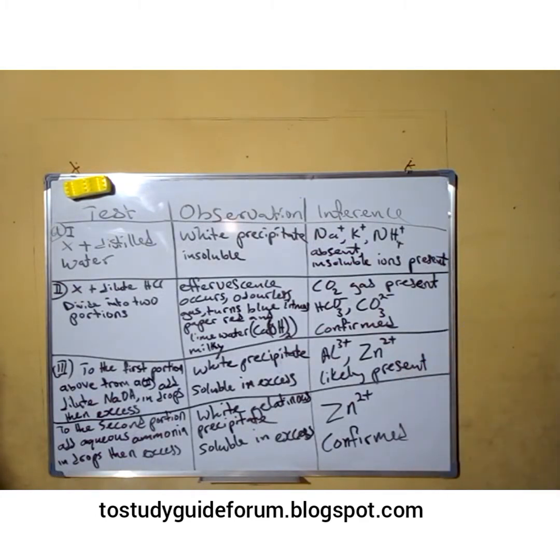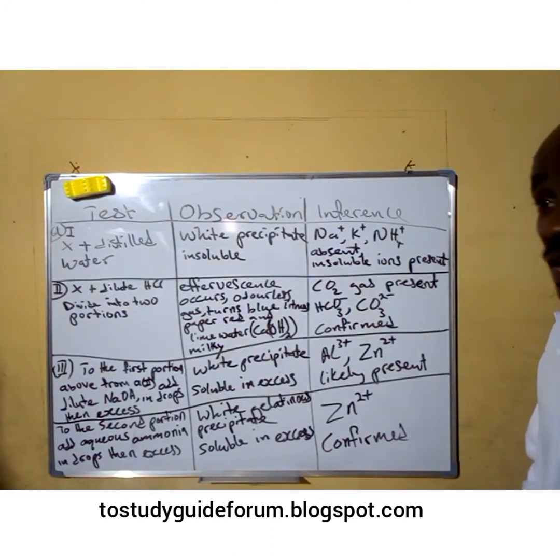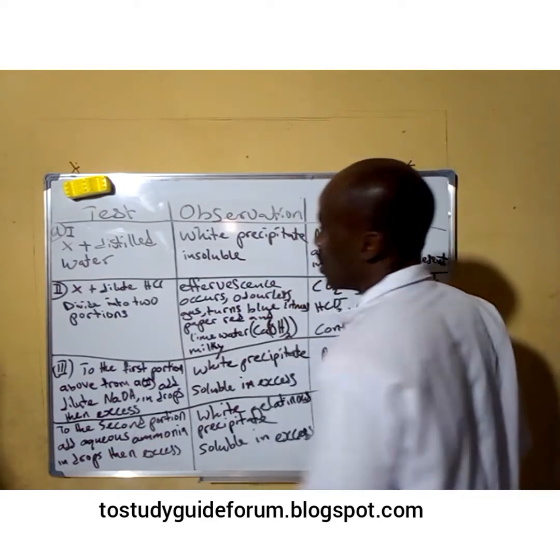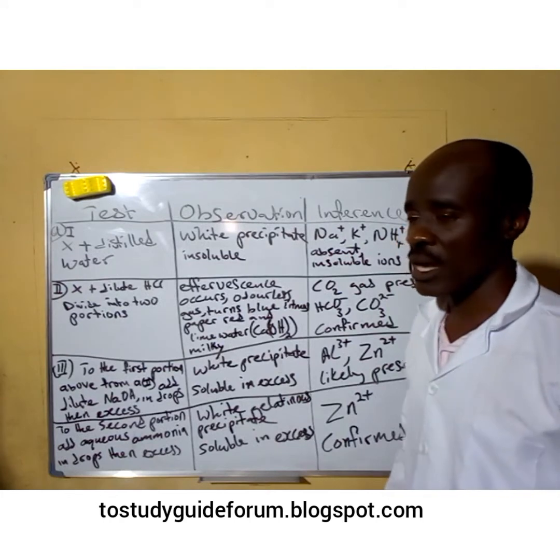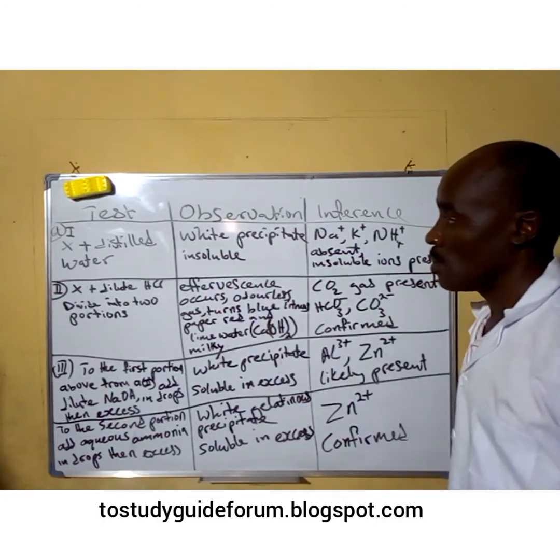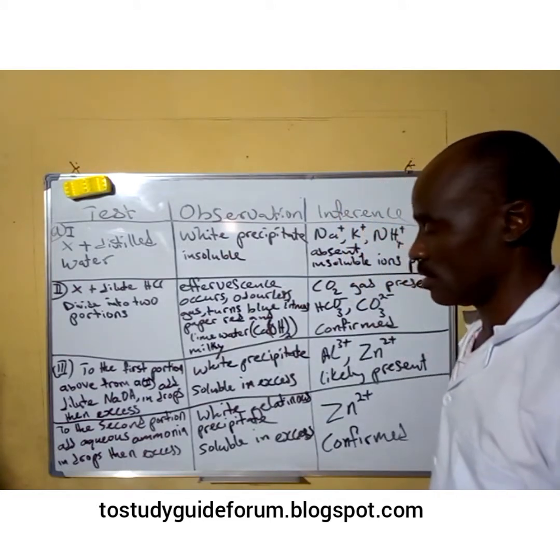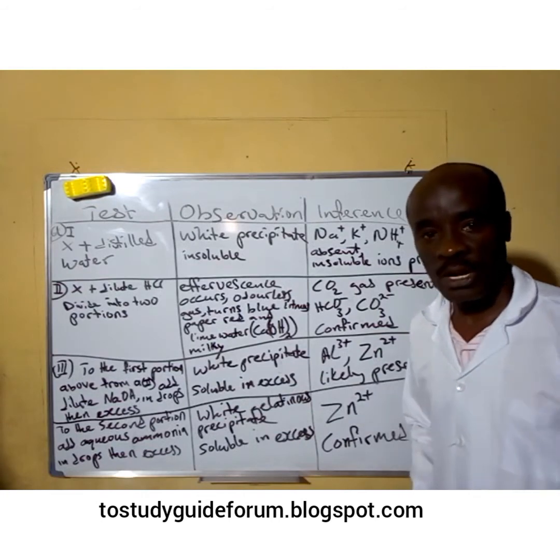Here we're looking at the possible NECO exam in chemistry, that is the qualitative analysis. In that analysis we were given two salts to look at, one tagged X and the second tagged Y. The one tagged X is known to be zinc trioxocarbonate(IV).